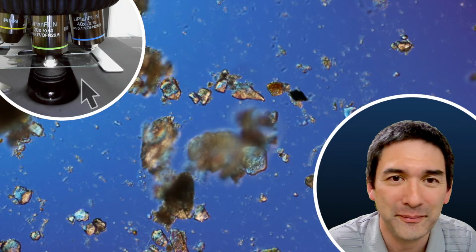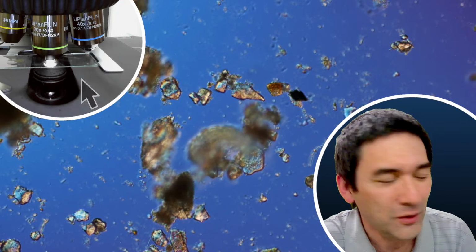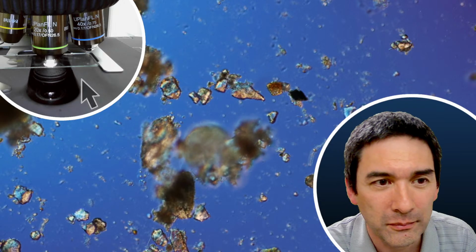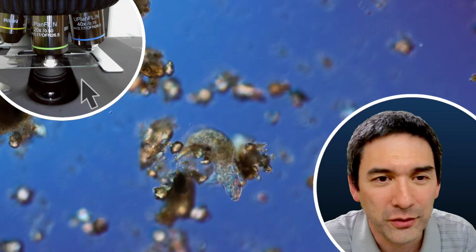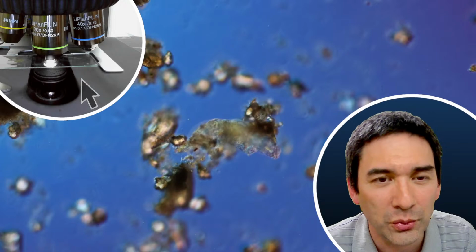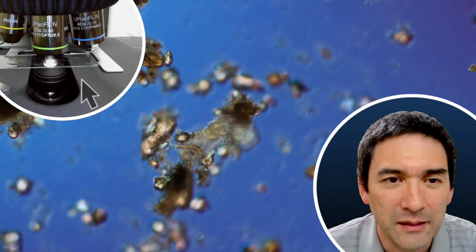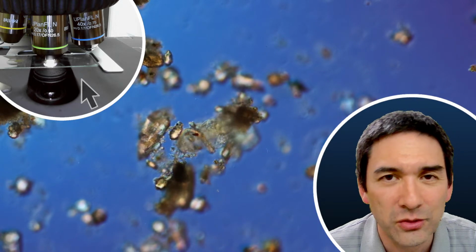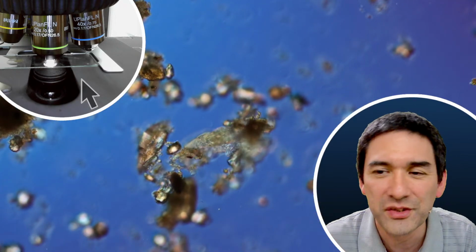Because if you want to see it like this, there's actually much more dirt and dust on the sample over here, all of the sand grains and all these things, which are there as well. But if you have dust somewhere and it's not moving, then you actually don't see it because it kind of blends in with the background. That's by the way also a trick sometimes to make videos, even if it's dirty, then you just don't move the slide around, and then you don't see the dust.